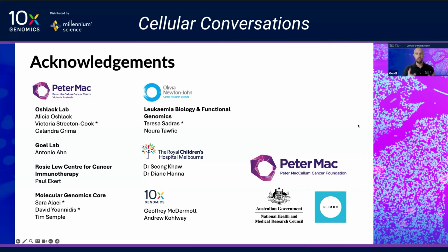All right, no other questions, but I do have a question, and we kind of chatted about this a little bit before the seminar kicked off. I'm a researcher, really interested in adding probes. 10X Genomics provides a technical note, which gives you some guidance on what to add to the probes in order for it to be detectable in the assay. But ultimately, where the probes bind, that design, the onus is up to you as a researcher. So how do you even go about tackling that question?